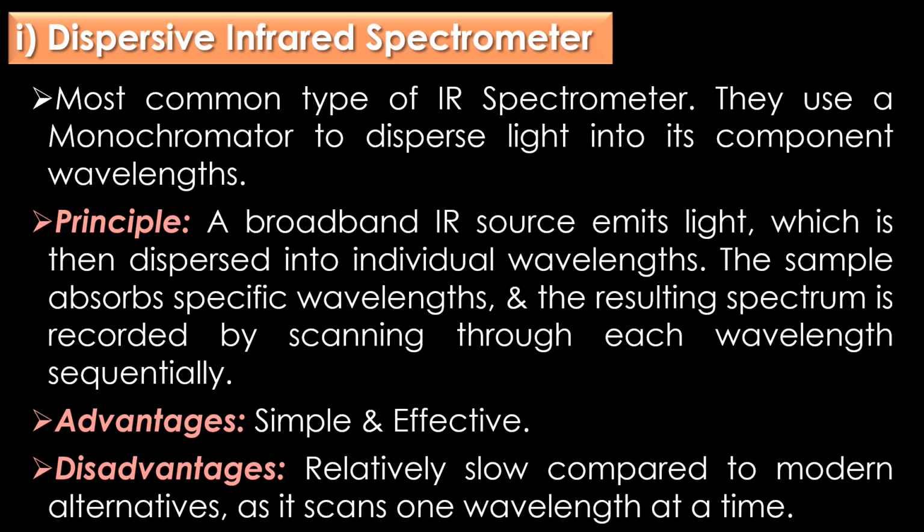Advantages: this technique is simple and effective for basic IR spectroscopy. Disadvantages: this technique is relatively slow compared to modern alternatives as it scans one wavelength at a time.